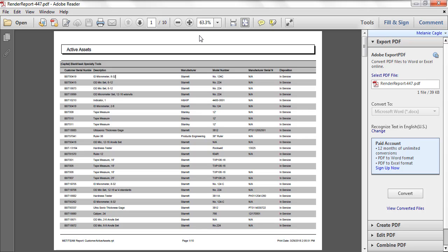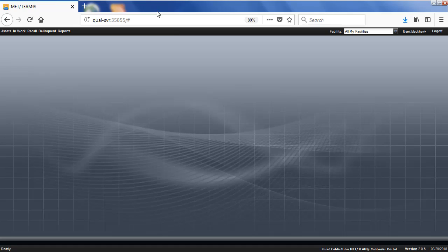If you want to see some more information on there, or if this is too bland, just let me know and I will create a report just for you. It will be in PDF. It's all done through Crystal Reports, but yes, I can do that for you. Not a problem. What's nice about it also is it gives you all the information date. So for audit purposes, this is really great.